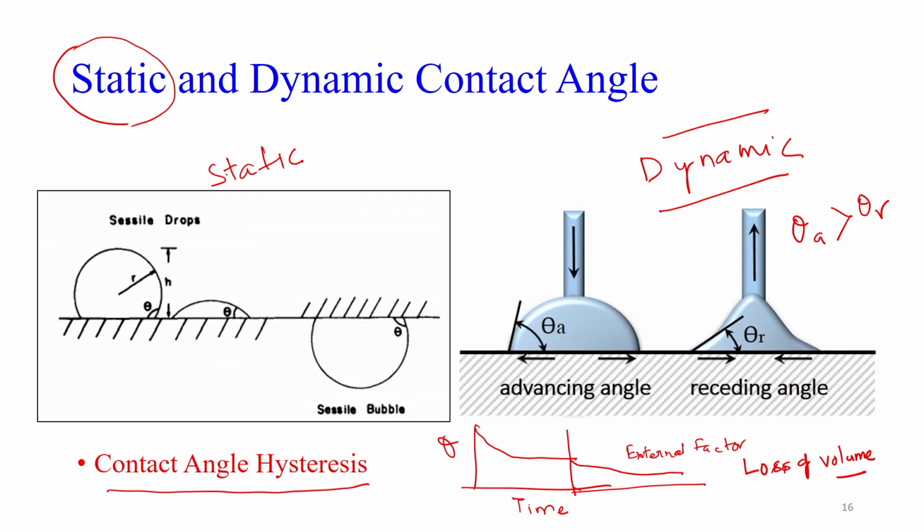To analyze the image, we can use the tangent method or the theta by 2 method. In both cases, we assume that whatever shape you observe in the camera is part of an imaginary circle.